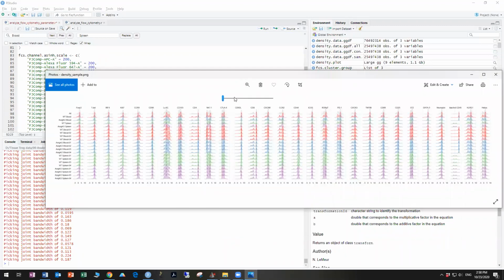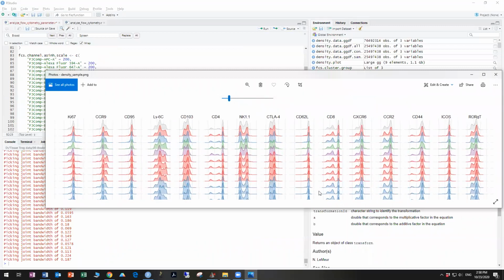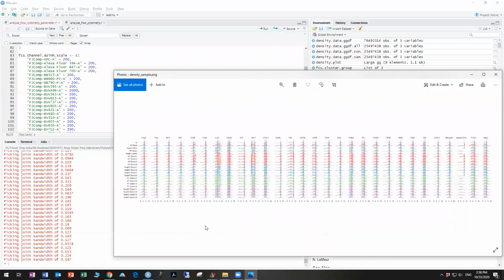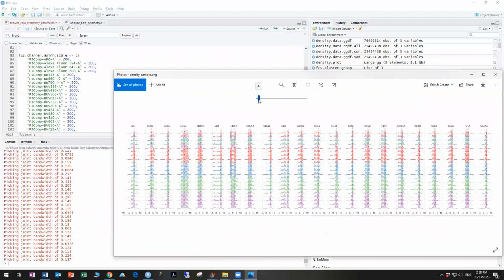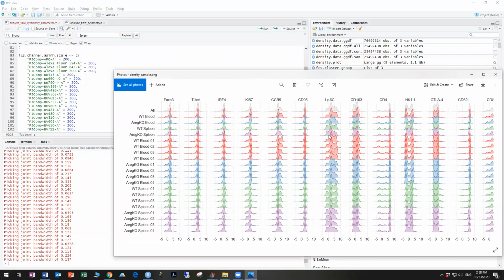And this is a bit of trial and error, and you may not know what the marker is supposed to look like. You should be able to figure out in a lot of cases by looking at FlowJo to see what the distribution looks like. If you aren't certain if it's correct, have some tries and then ask questions. So I'm going to go through and take these default values and edit them to more appropriate values for Aurora data. Because we have a large parameter data set here, we're going to have more spreading in the negative. We're going to need to apply more correction across the board.